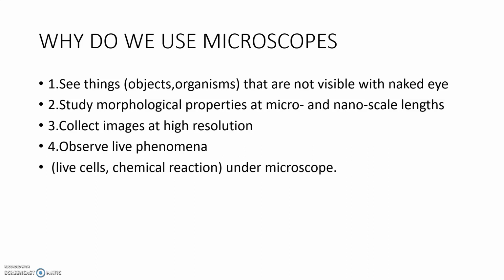So what do you mean by microscopy? It is the science of investigating small objects using such an instrument called a microscope.